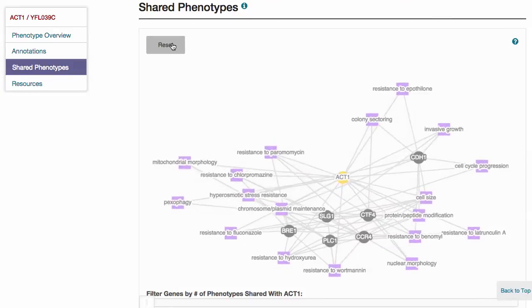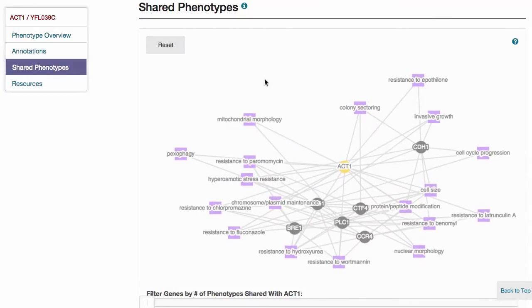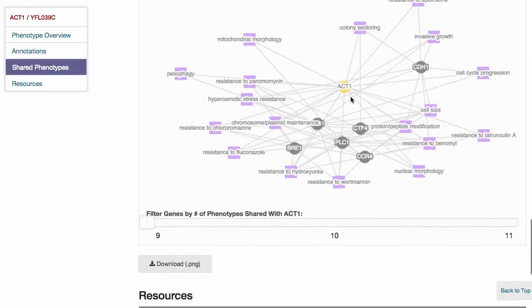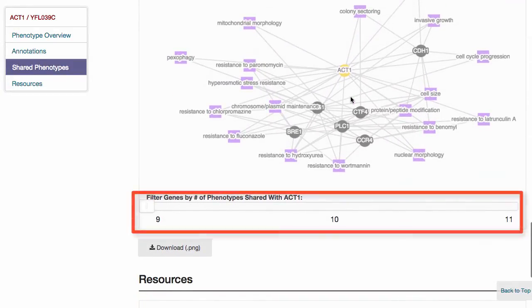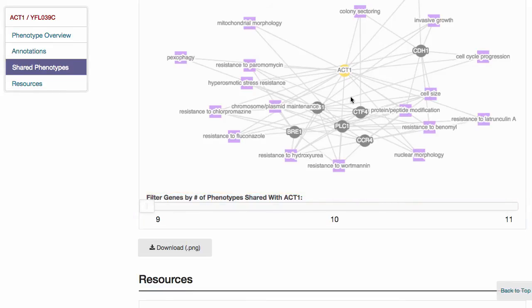Filter the genes with observable terms for a given gene by the number of terms they share, by clicking anywhere on the slider bar or dragging the tab to the desired filtered number. The network diagram may also be downloaded by using the download link underneath the graphic.